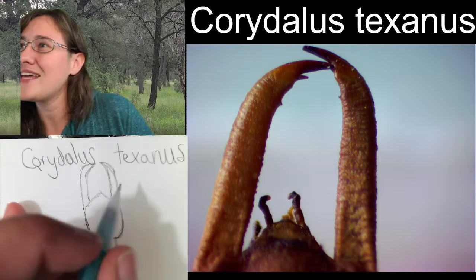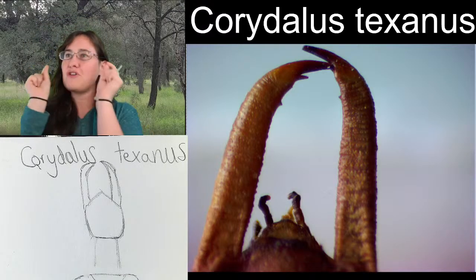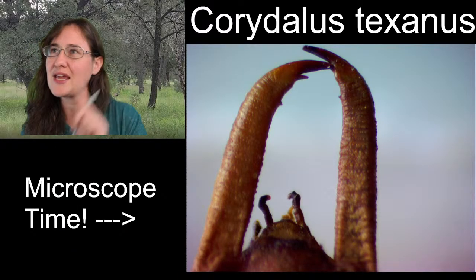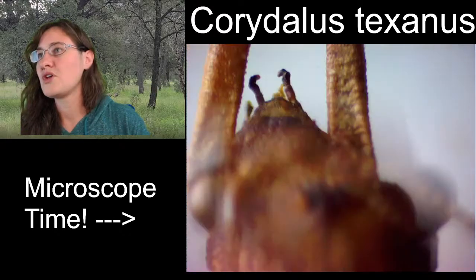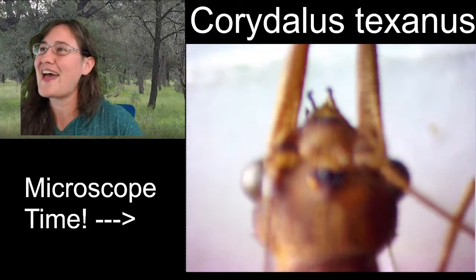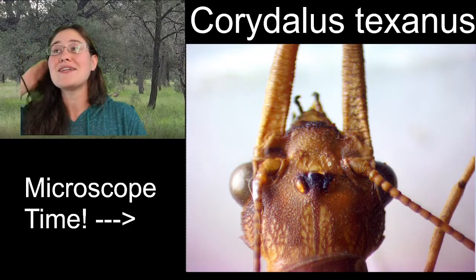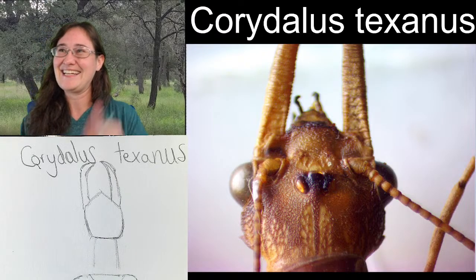And I like that the mandibles, they have those little rings around the end of them, around the median, I guess. I like the rings. Alright, we're going to zoom out again so that we can see at least the entire head for sketching purposes. But I'm glad we got to zoom in and look around. And you can barely even tell that I just glued that antenna back on.